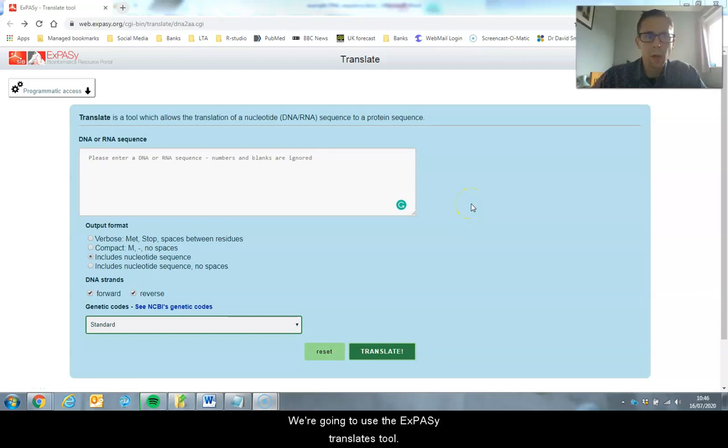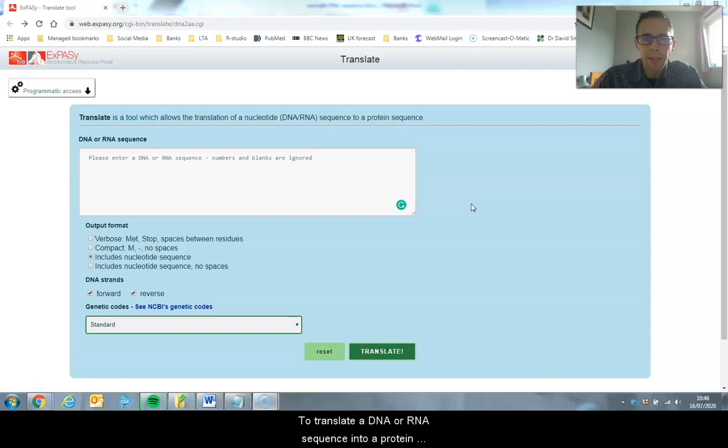In this video we're going to use the EXPASY Translate tool to translate a DNA or RNA sequence into a protein sequence.